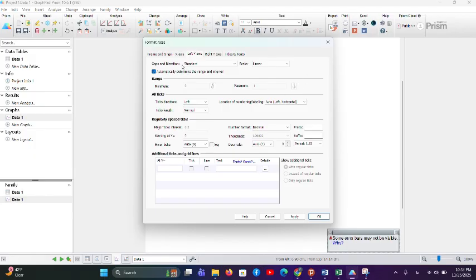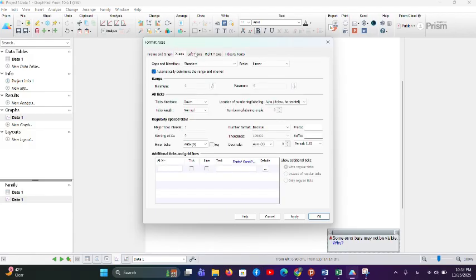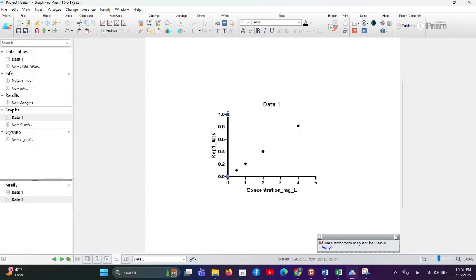This section is also possible. You can just change the style and format of X, Y, frame of origin, and right Y, title, font, and stuff down here, which is quite easy. And you just need to click the apply button down there. If you just do this, you can make it taller. Actually, you can expand your graph. Also, it's possible for the horizontal form too.